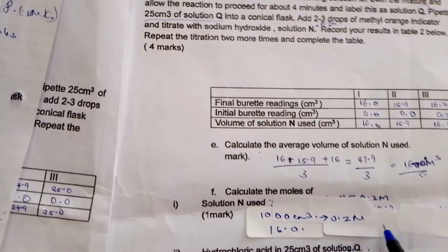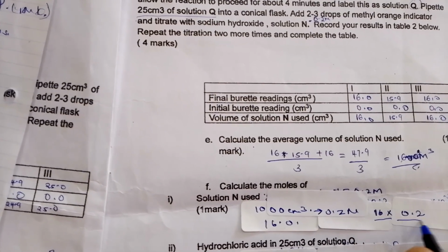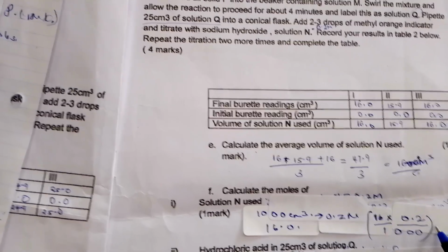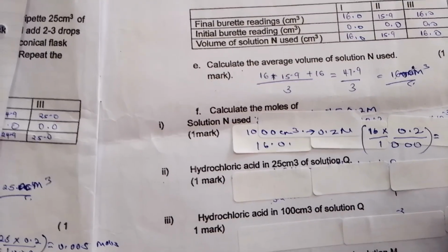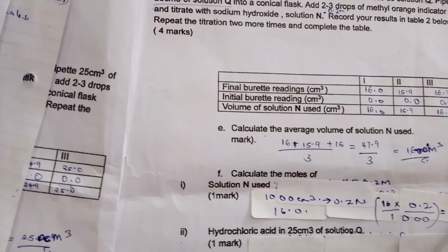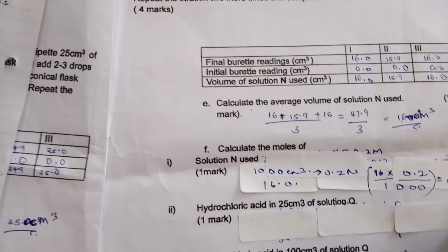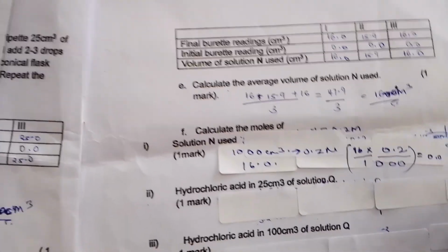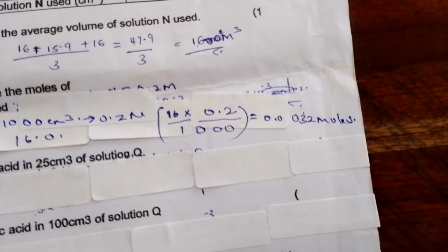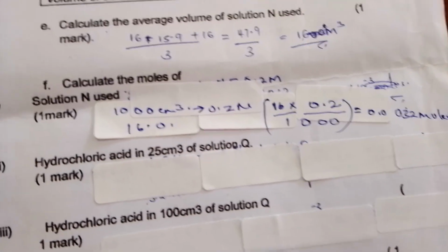We take 16 times 0.2, divide by 1,000, and then close the brackets. If you do your calculations very well, you will end up with 0.0032 moles.